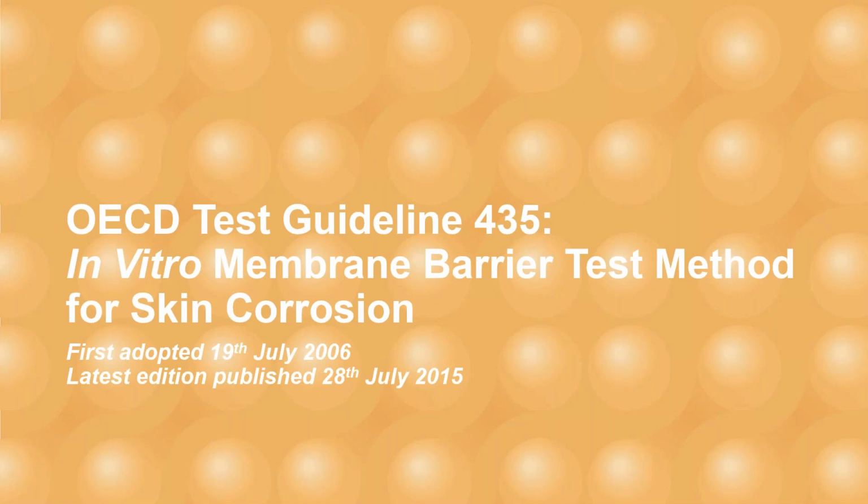If we move on now to a slightly different method, and that's OECD Test Guideline 435, the in vitro membrane barrier method, which also has been around for quite a long time, for 14 years. It was first adopted in 2006 and last updated in 2015. Next slide.